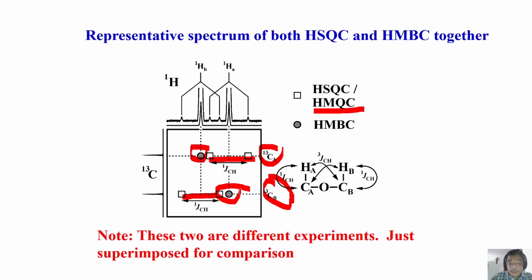Okay, with this, I will stop today. We'll come back and then continue with HSQC. Then we go to the J-resolved experiment, both homonuclear and heteronuclear. And I don't know whether I have time to talk more about NOE. I will come back to that NOE later. And then there are a lot more things we can talk about. You can talk about the INADEQUATE experiment.